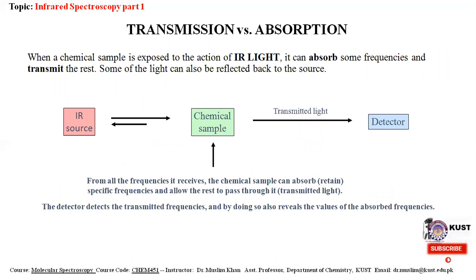So when a chemical sample, your analyte molecule, is exposed to the action of an IR source, it can absorb some frequency and transmit the rest.